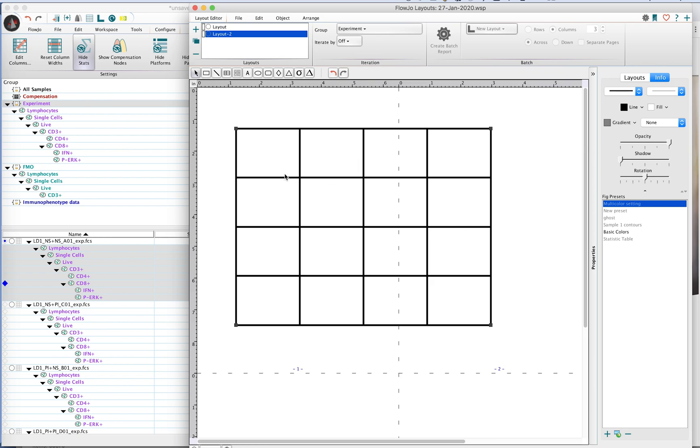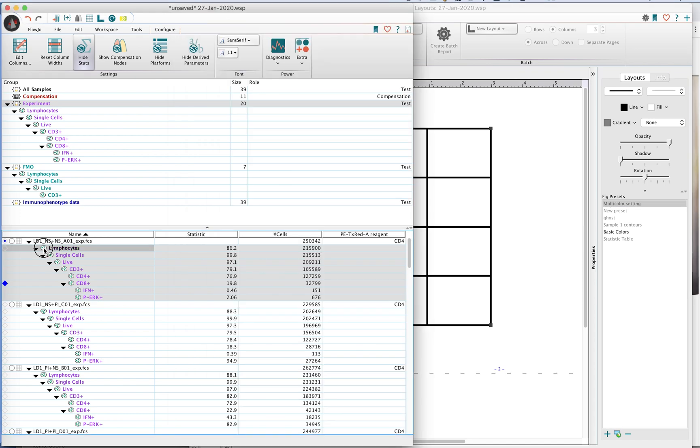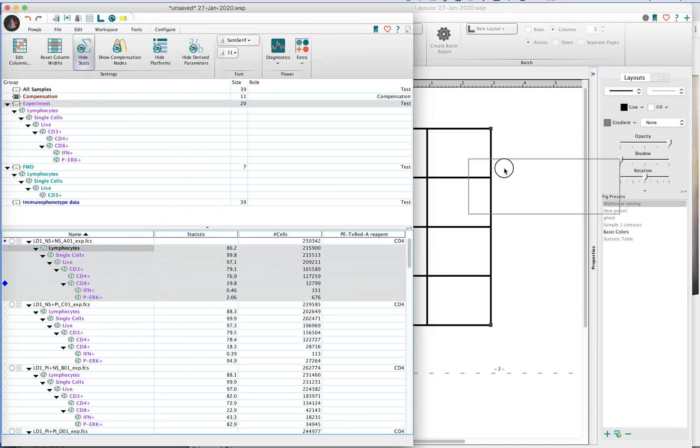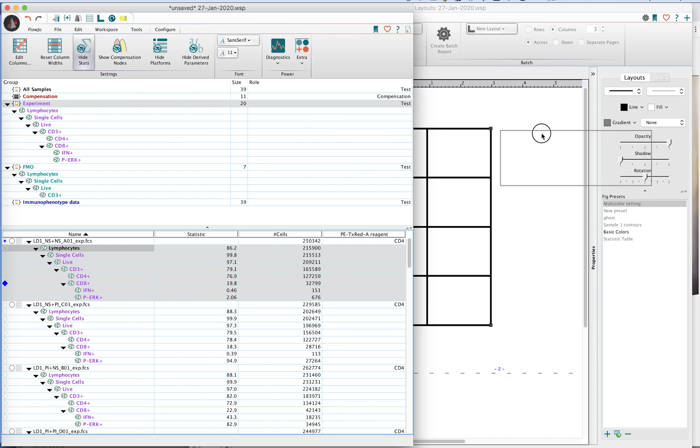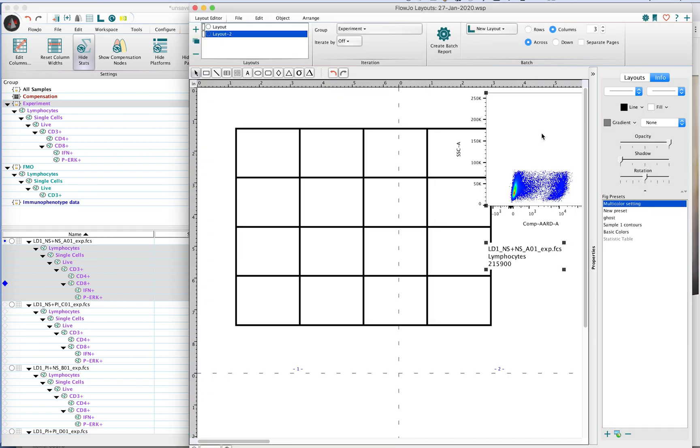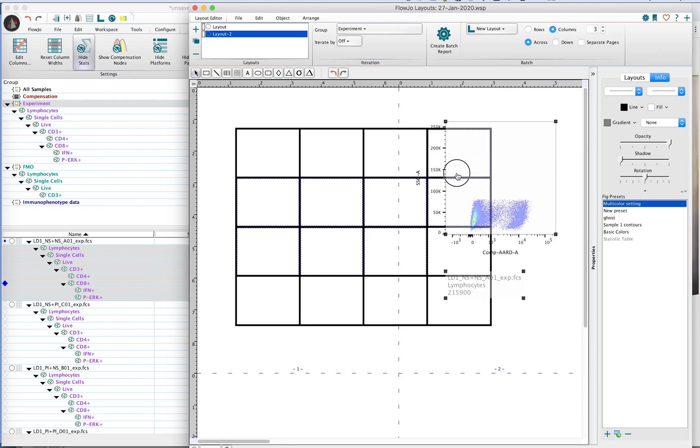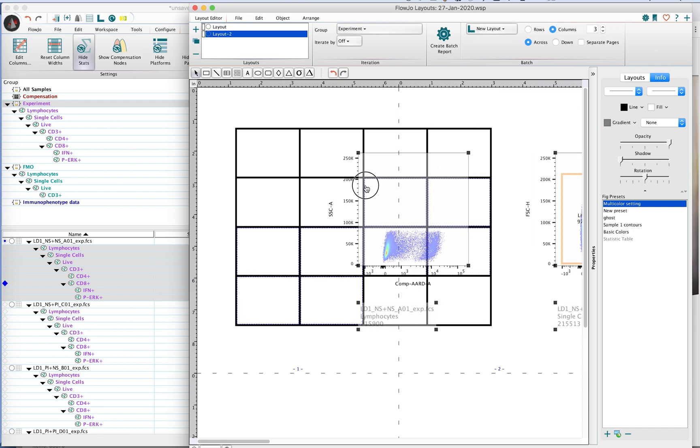We create the grid by clicking on that grid tool and we go back to the workspace. Drag in our plots but do not target the grid—we actually miss and just target some area off to the side.